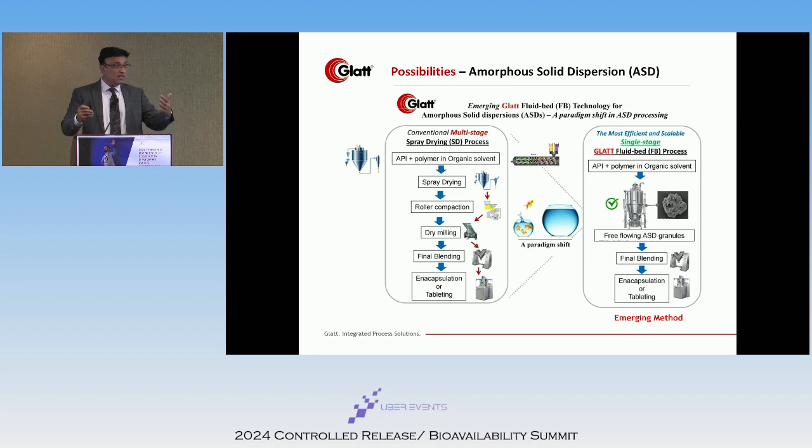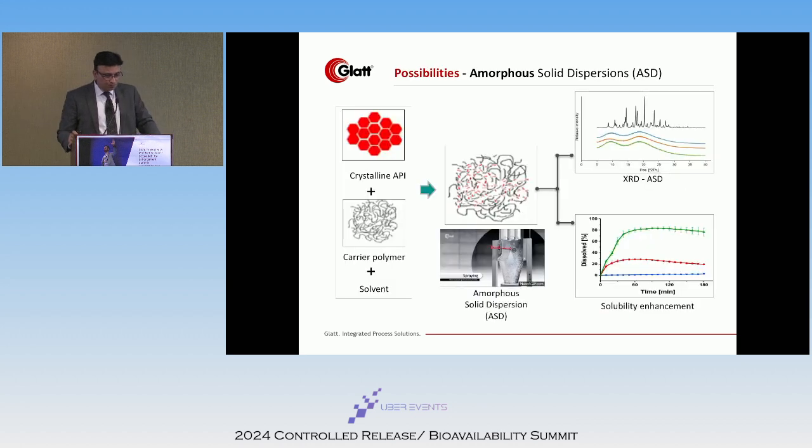Did it happen? Does it happen that way? That's, I would say, a very novel and emerging new way of making amorphous solid dispersion using Glatt fluid bed technology.